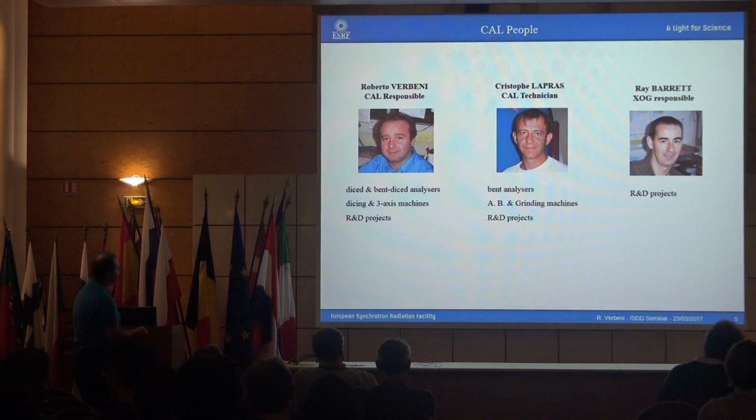Okay, so these are the people working in the lab. You have Christophe, the technician. He is a master of the bent analyzers. He is responsible for the production of the bent analyzers. I will explain later the difference between dice, bent dice, and analyzer. He is also the master of the anodic bonding machine and the grinding machine.